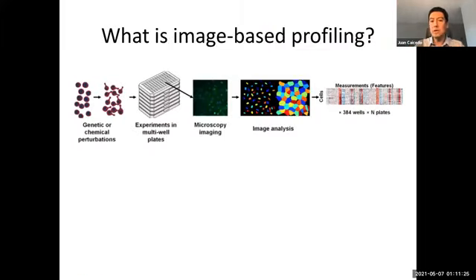And that is what we call image-based profiling. So basically, this is a way of studying the morphology of cells or the state of cells using images.